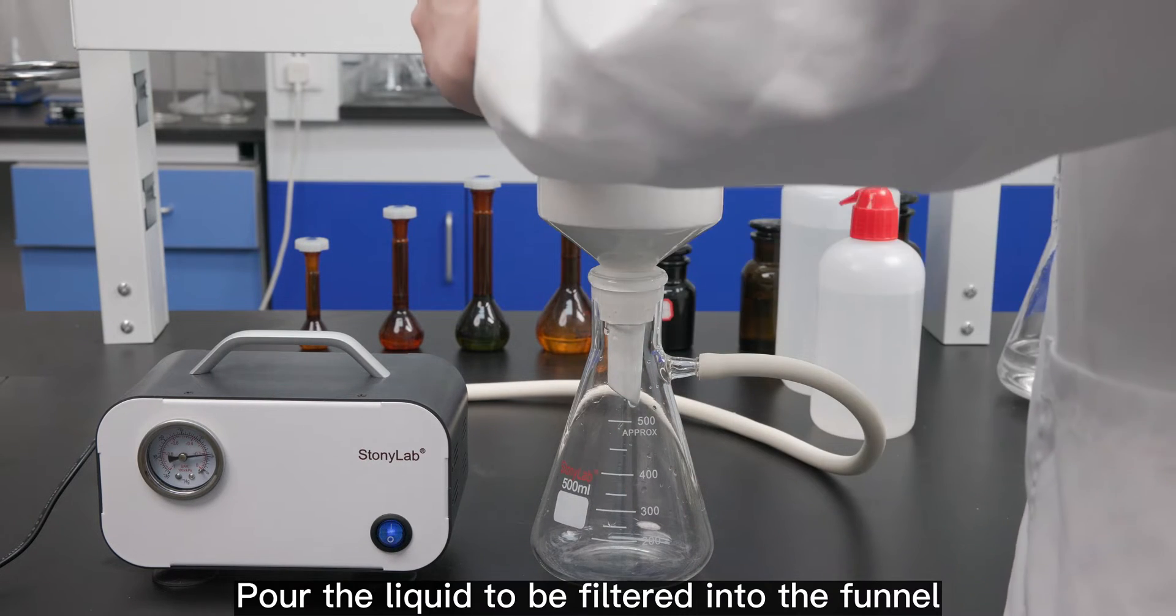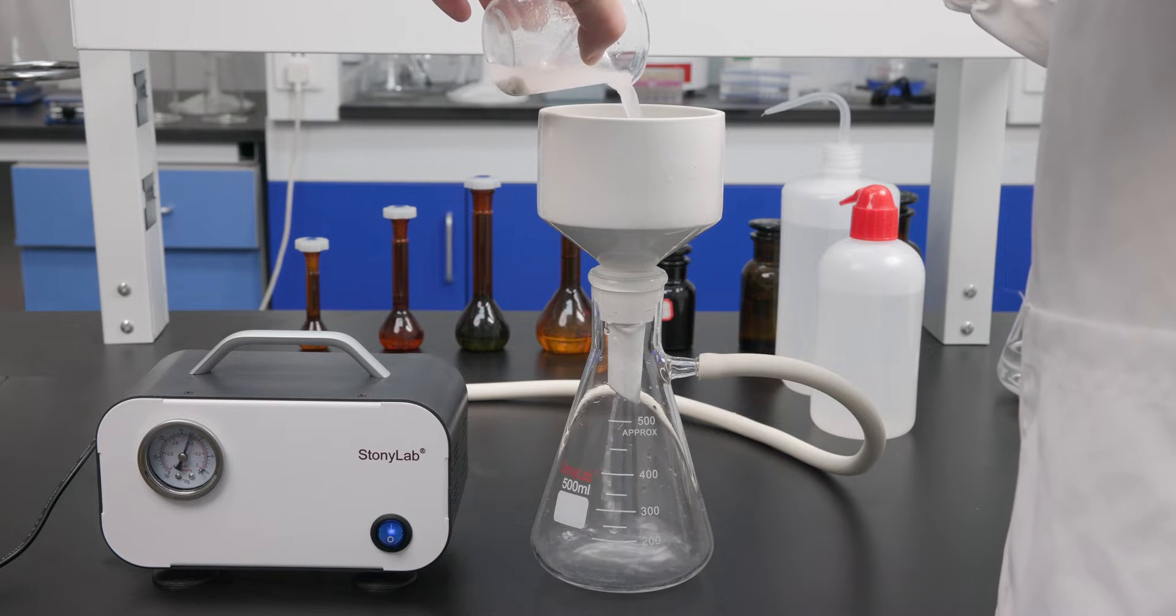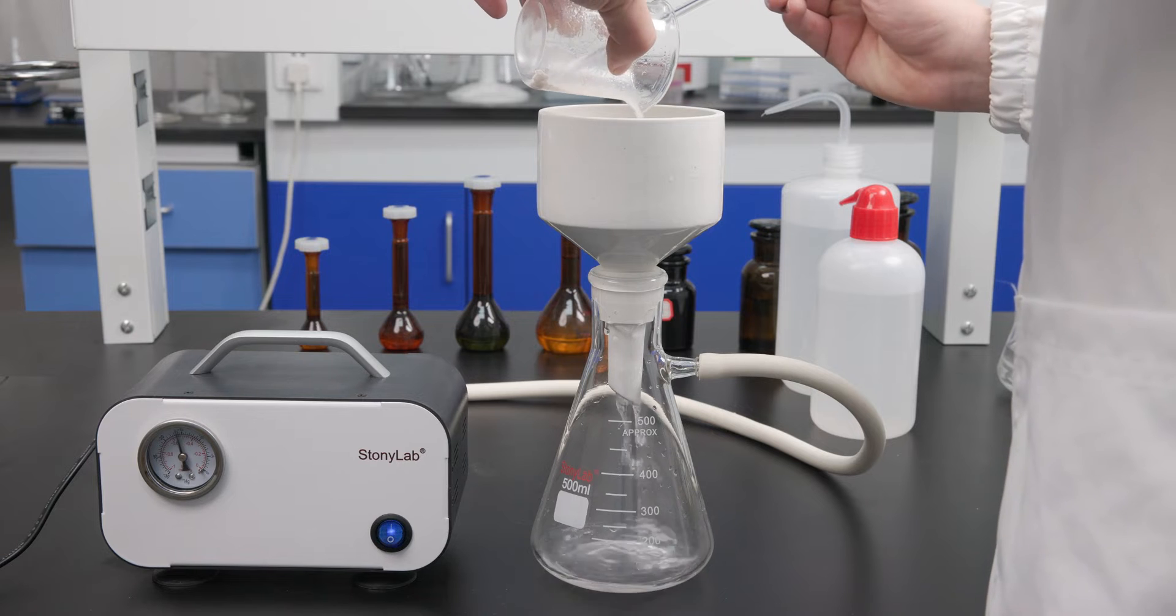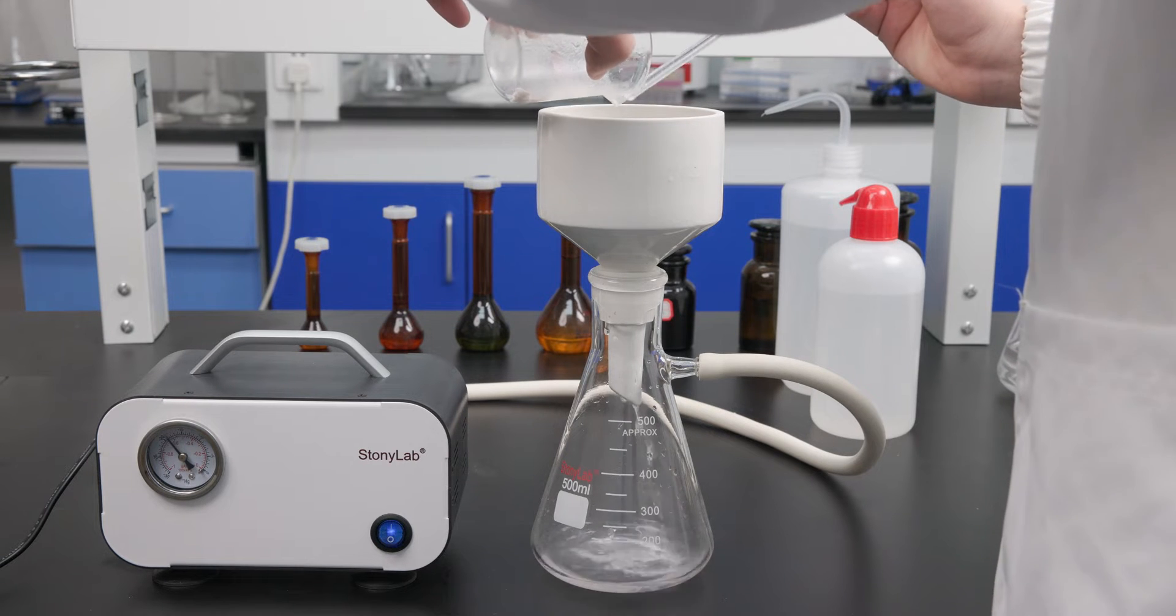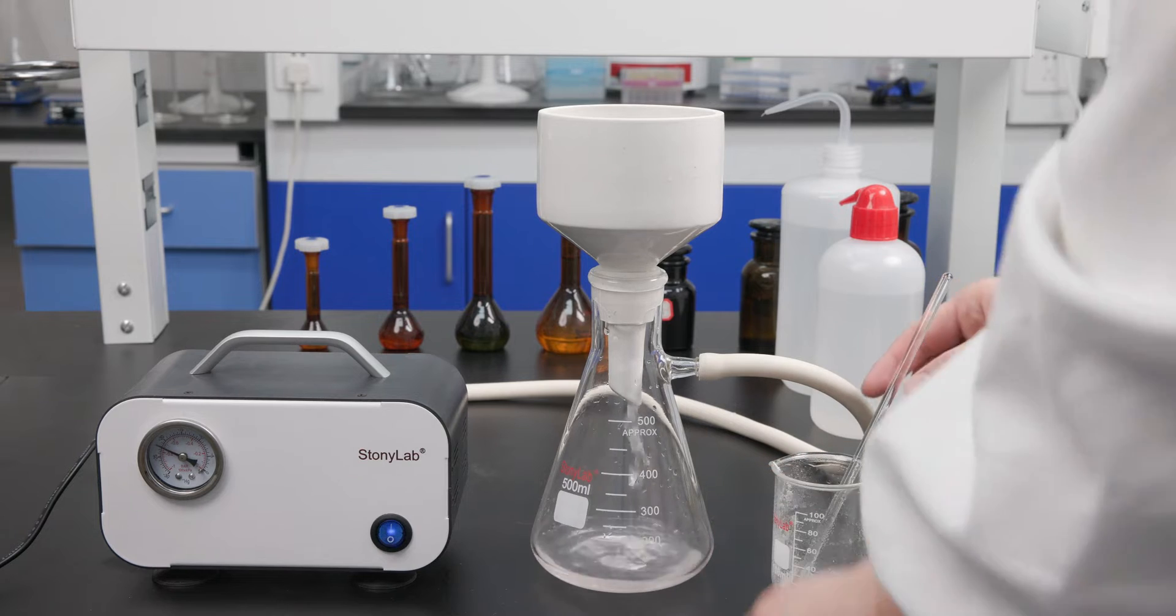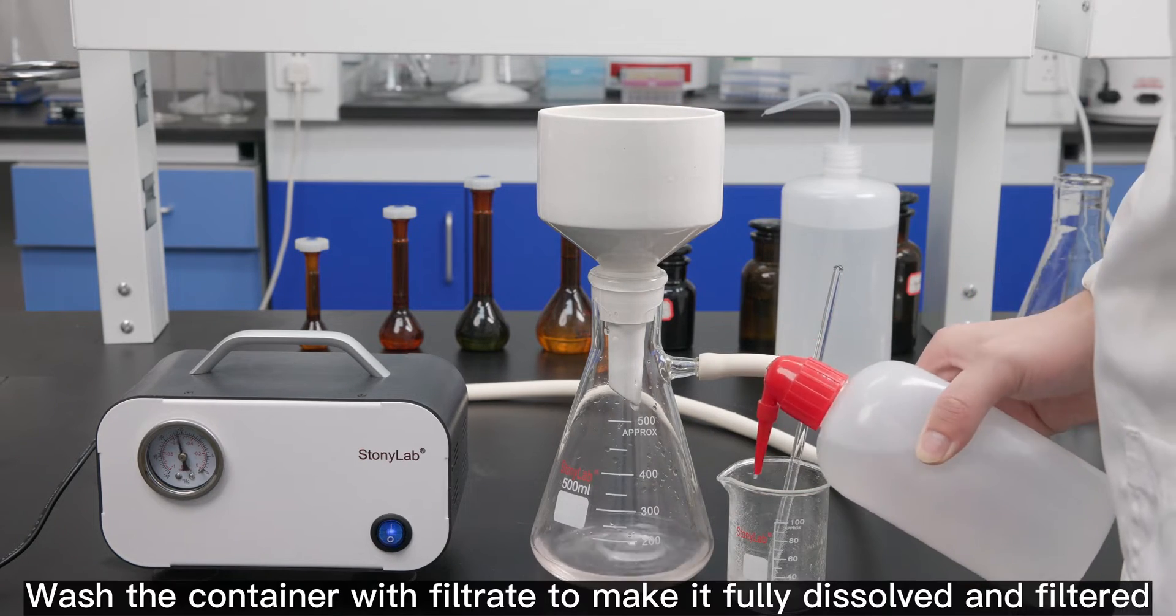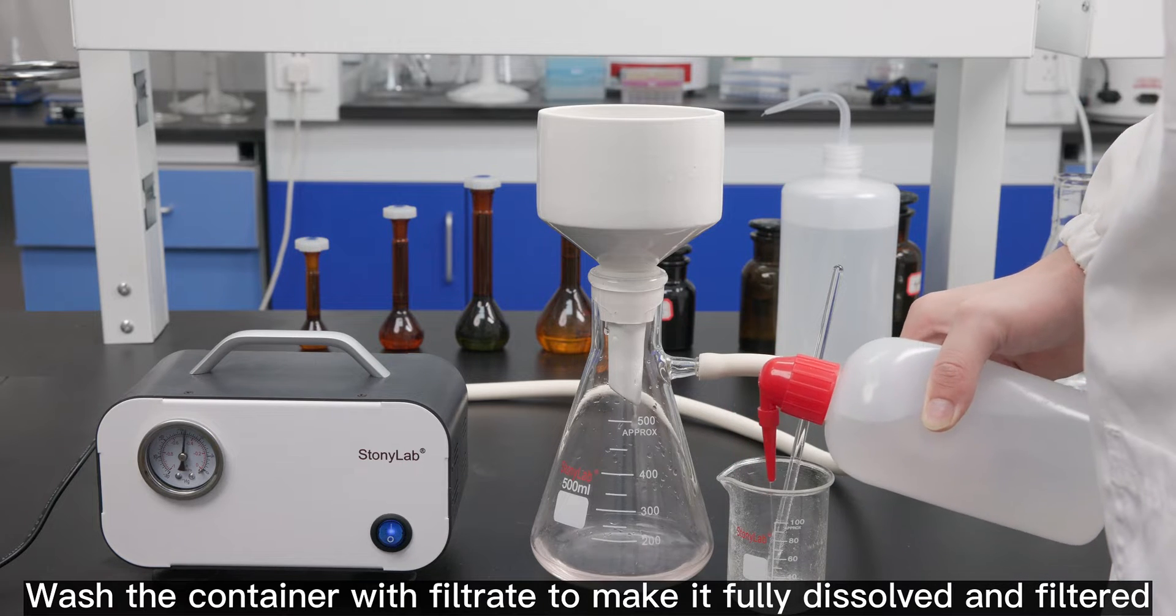Pour the liquid to be filtered into the funnel. Wash the container with filtrate to make it fully dissolved and filtered.